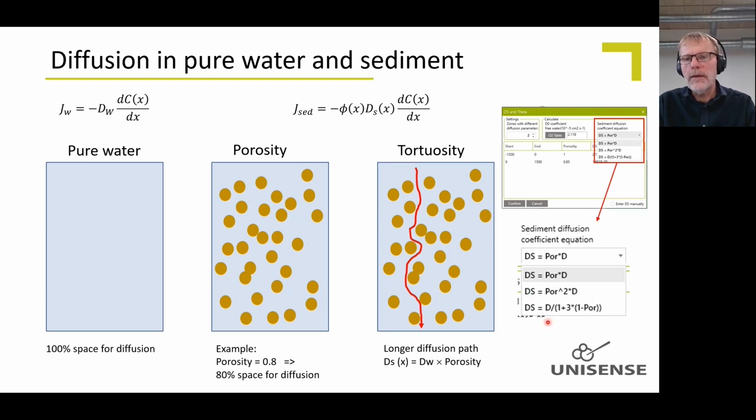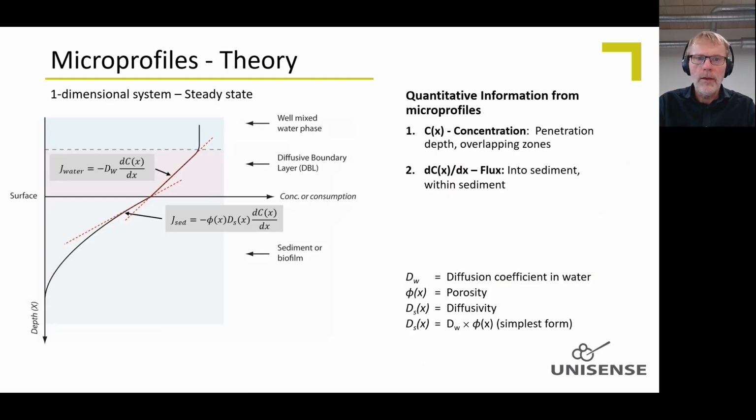And then finally, there is a sort of empirically derived equation for how to calculate diffusivity. It's taken from a Bernie Boudreau paper where he's analyzed a lot of sediments. The reference is mentioned in the application note that I mentioned a little while ago.